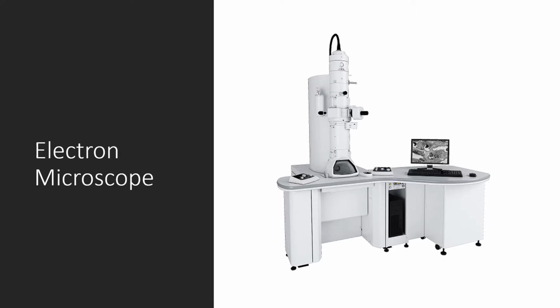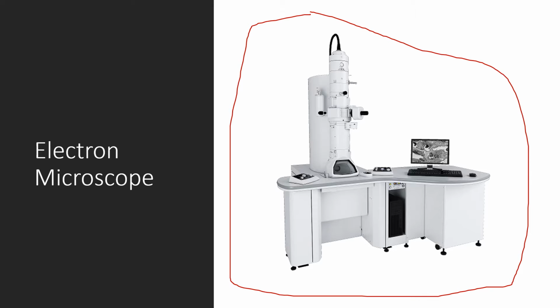For that, let's get started with electron microscopy. But again, as one of our rituals, we're gonna see the electron microscope. Of course, it's different over here. We have some other equipment along with the screen. Now, why is that happening? Because this time we are using electrons, not light. So we need to ensure the electrons do not hit any air molecules, because when electrons hit air molecules, they collide and scatter. But we want electrons to hit only our specimen.